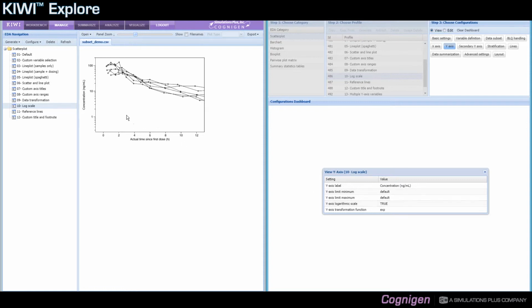So this field controls the display of the axis on the log scale, showing the logs and some minor tick marks on the intermediate values. So all these options are available on the x and y axis.